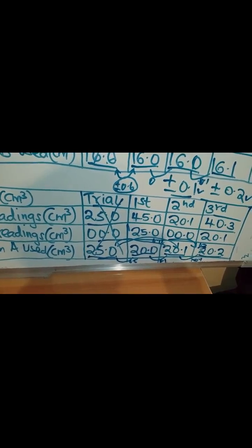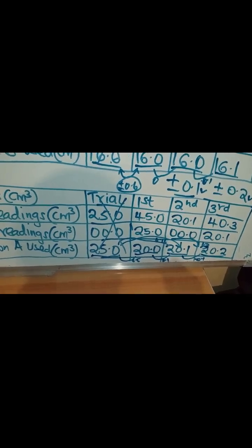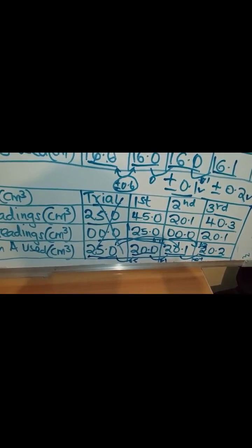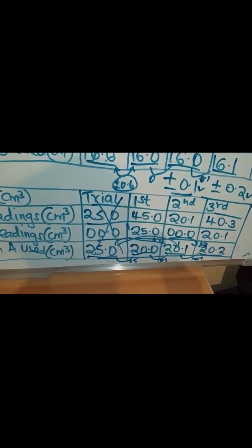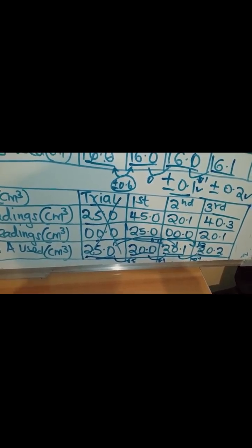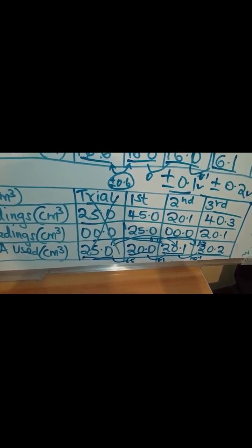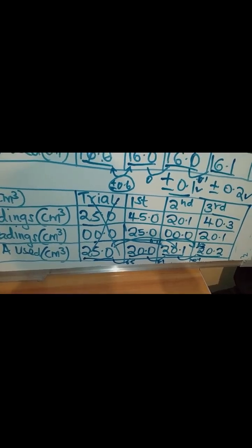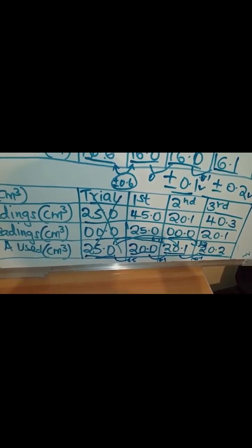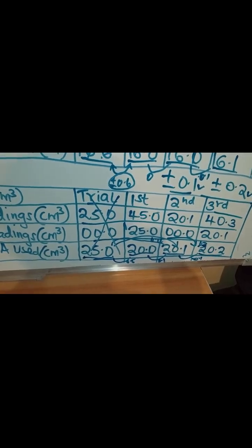you have done your titration and for some reason, maybe out of anxiety, you spill some chemical, or some of the chemicals are contaminated. As you do your other experiments, by mistake, you contaminate the chemicals.